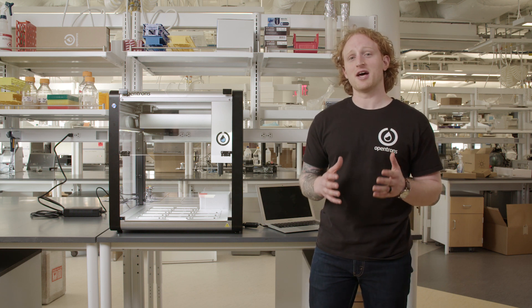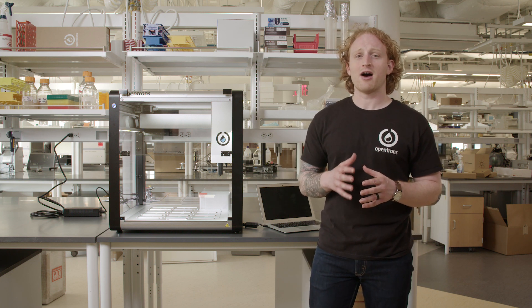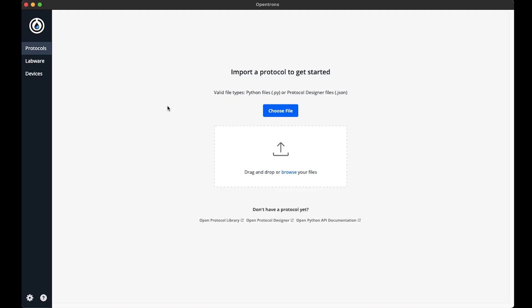Tip length calibration accounts for how a tip fits on the nozzle of a specific physical pipette. Once this is calibrated, the OT2 knows how far up or down to move the pipette when it's running your protocol, so that the tip is positioned at the correct height. Tip length calibration doesn't account for differences between individual tips — the OT2 assumes that each tip has a consistent length with other tips of the same model.